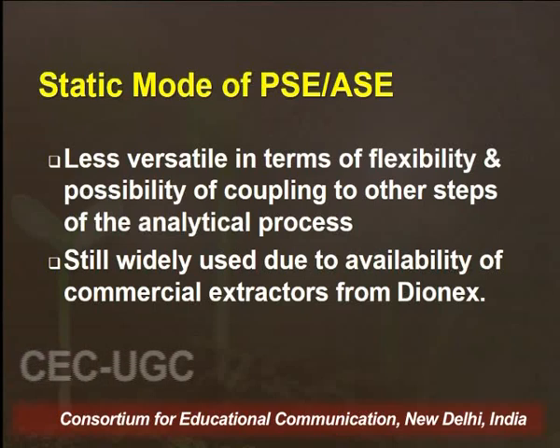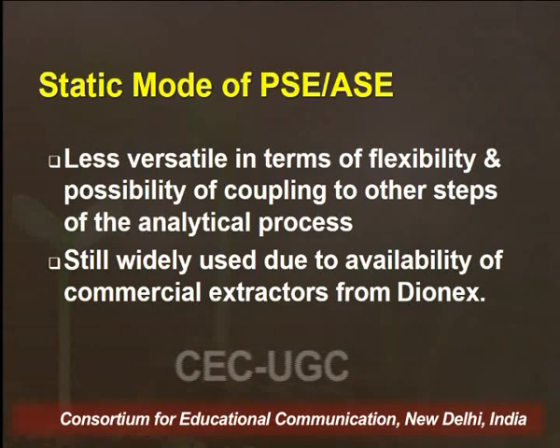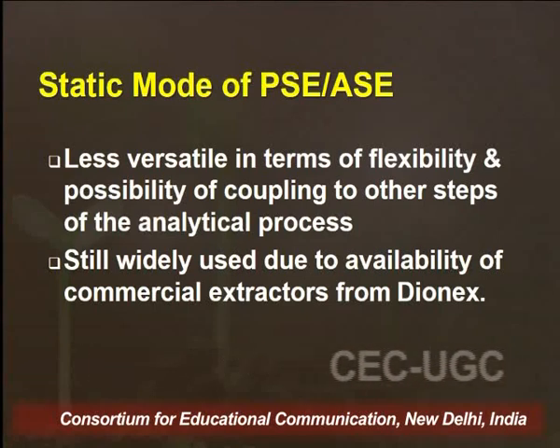So the solvent keeps on flowing through the extraction cell, and every time the drug comes in contact with fresh solvent, which further increases the extraction process. Now we will discuss each mode in detail. So coming to the static mode of PSE or ASE. This mode is considered less versatile in comparison to the dynamic mode in terms of flexibility and possibility of coupling to other analytical processes.